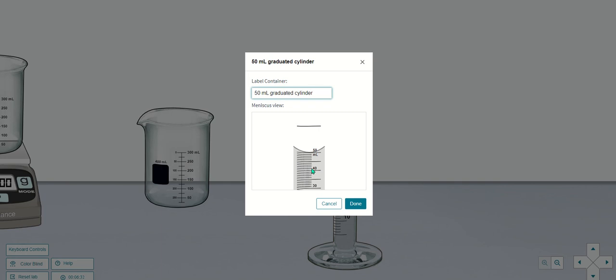Please excuse me. But anyway, it's going in 1 ml increments. So actually, I would just record the 50. That's what I would record. So it's going 41, 42, 43, 44, 45, 46, 47, 48, 49, 50. You were probably screaming internally when I was reading that. You were like, what? Anyway, caught it. Mistakes happen. That's completely okay.